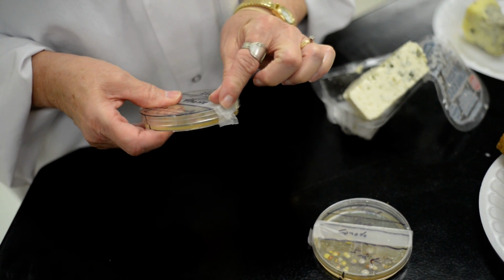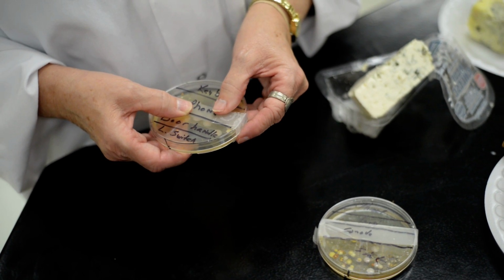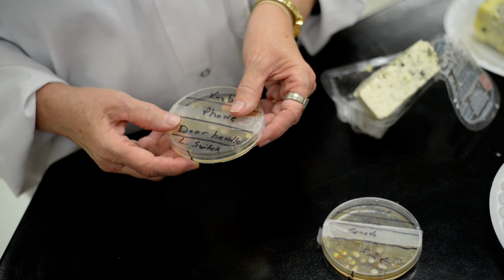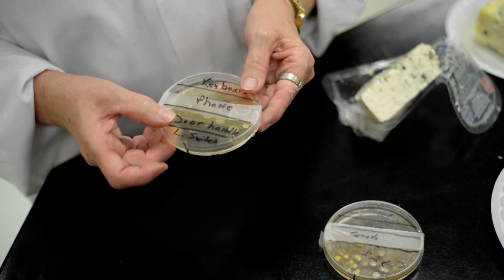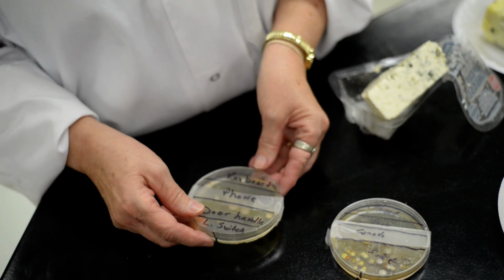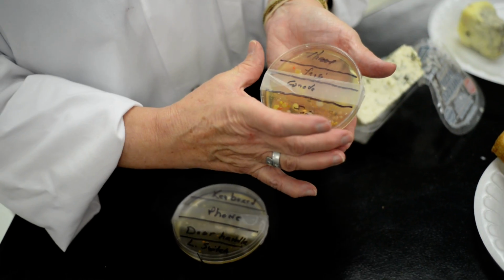It does need to be sealed. Light is not its friend. It does better in warm places, so if you have a nice warm place for it to be, that's the thing to do. If you buy the little things already poured, then it will give you directions about the temperature and so forth. If you make your own, obviously keep those things in mind.